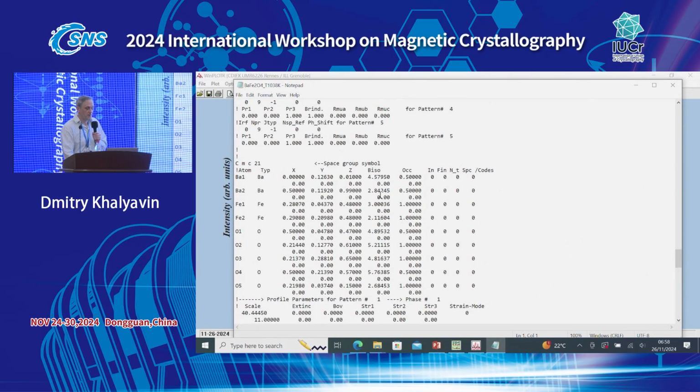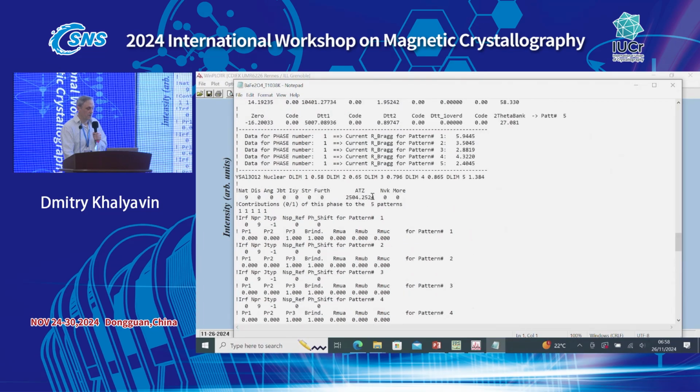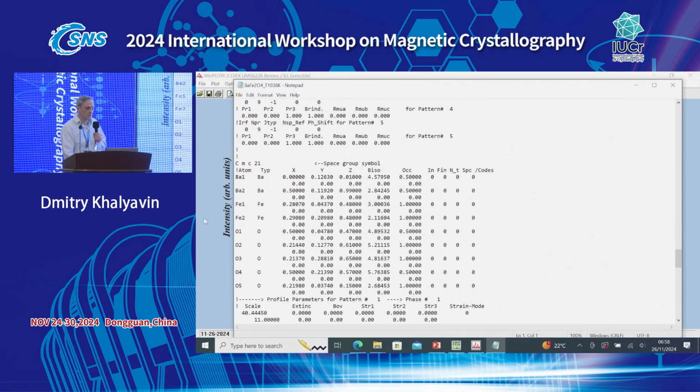Okay. So as a last step, let's say, if you want a further improvement, you can let atomic coordinates and thermal parameters vary as well. Yeah, actually we can do it. So we just put everything. Let's refine. Because you see, some of the coordinates have to be fixed by symmetry. For instance, this first coordinate for barium is fixed by symmetry. But I'm telling the program refine.